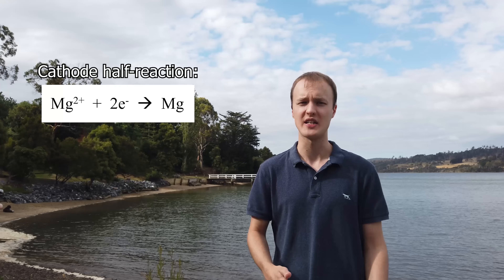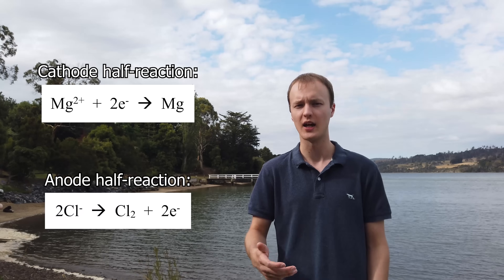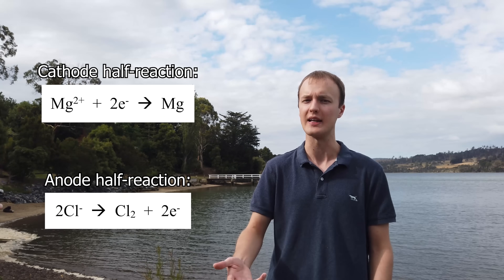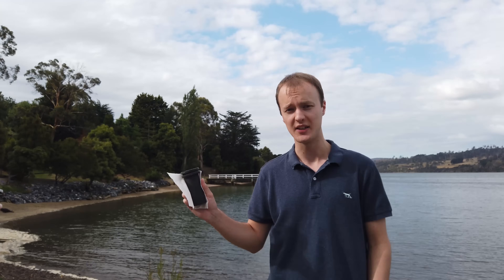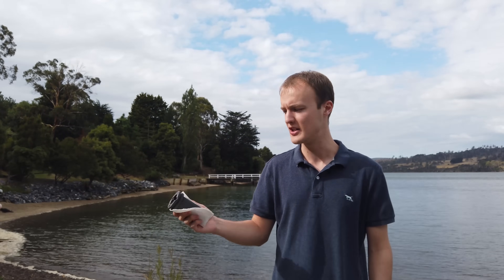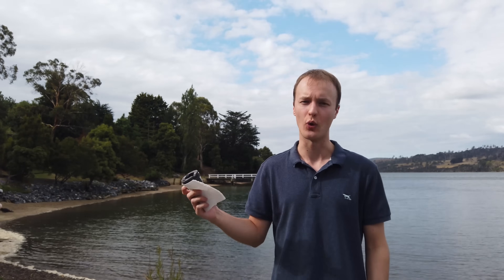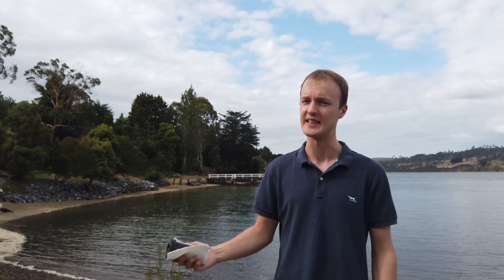When we apply electrolysis to our molten mixture, we expect the cathode, or the negative electrode, to reduce magnesium ions into magnesium metal. Likewise, we expect the anode, the positive electrode, to oxidize chloride ions to chlorine gas or something similar. Because it worked so well when we were making calcium in a previous video, I'm actually going to use the graphite crucible that we're going to melt everything in as the anode itself. We know that graphite is good at doing the chlorine evolution reaction at these temperatures, and the high surface area should allow us to do the reaction quite quickly. For the cathode, we're just going to use a steel wire — it's worked in the past and it's easy to set up.